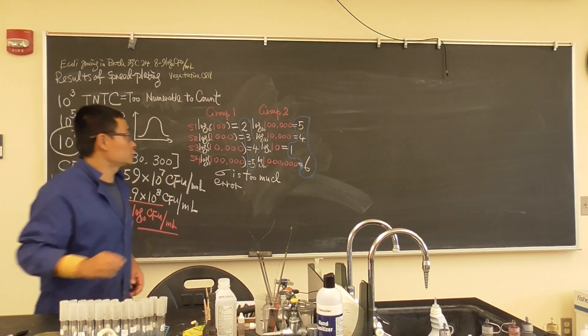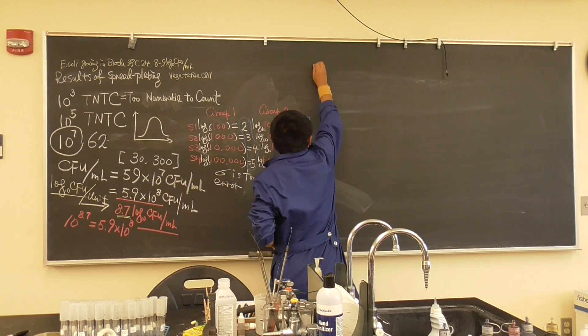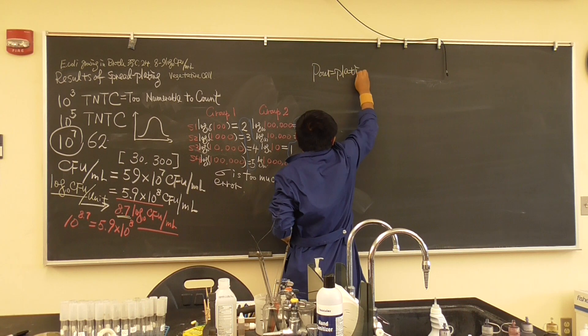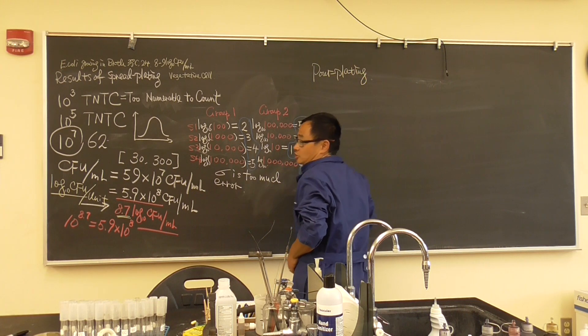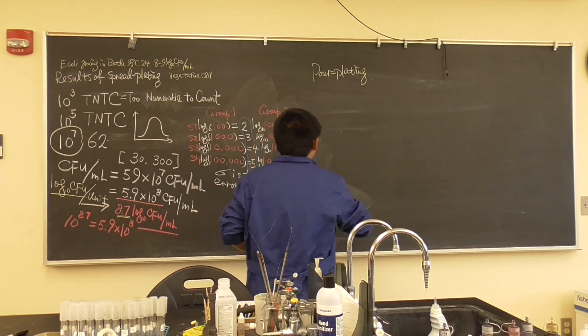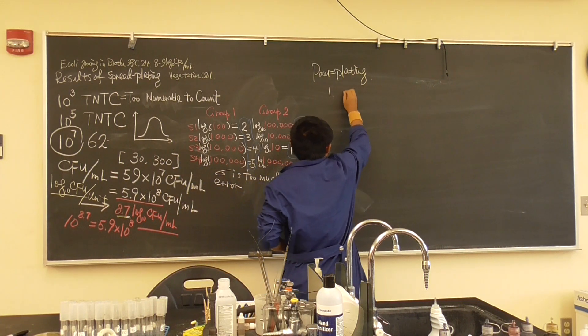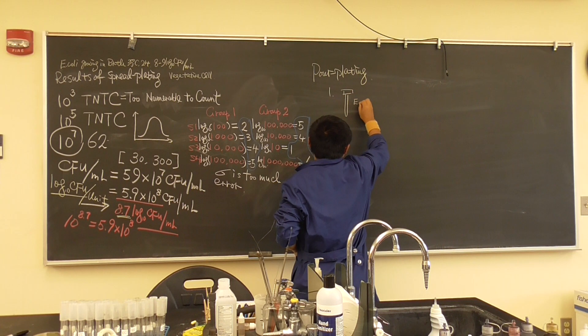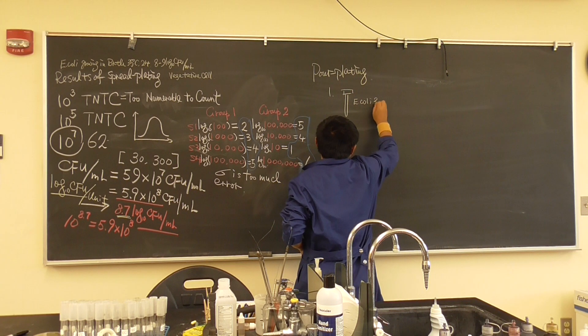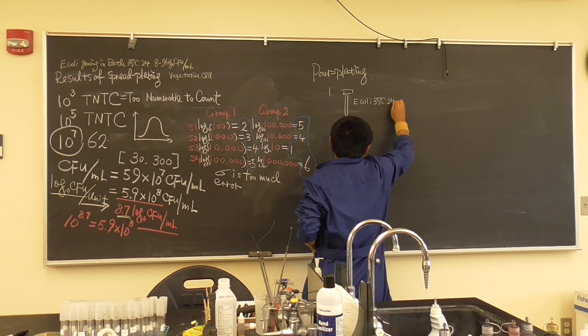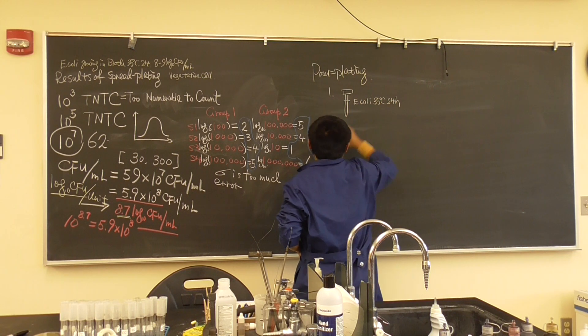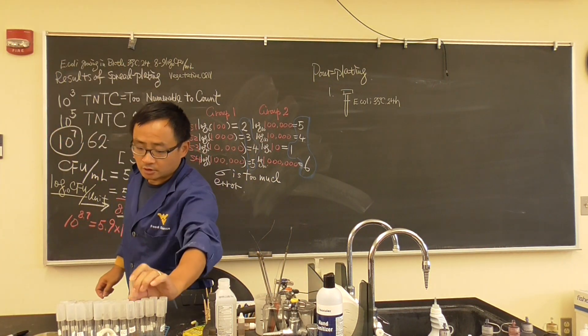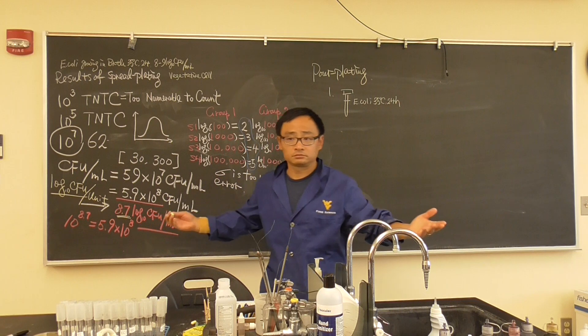Today we're going to do pour plating. The same procedure as before, so you do by yourself. How we do it? Everybody will get E. coli culture. This is the E. coli, grown at 35 degrees Celsius for 24 hours. There's lots of bacteria there.